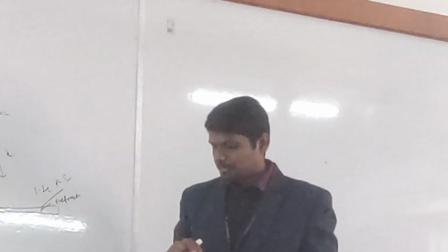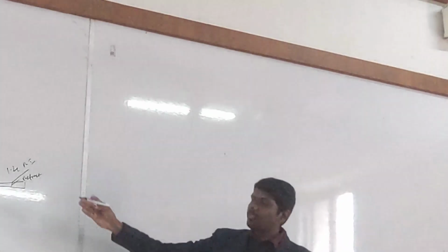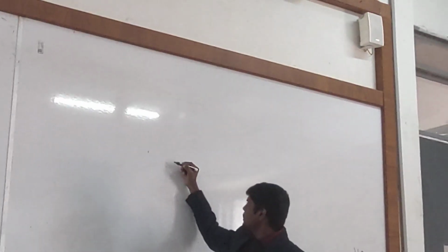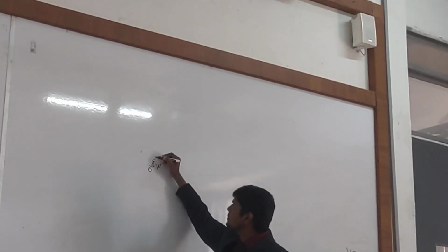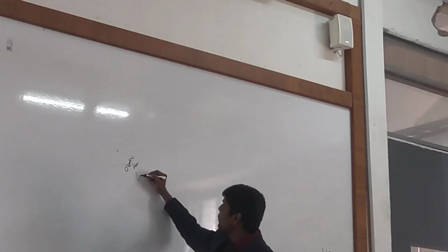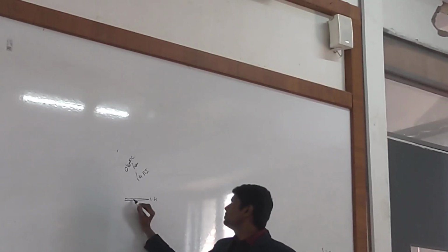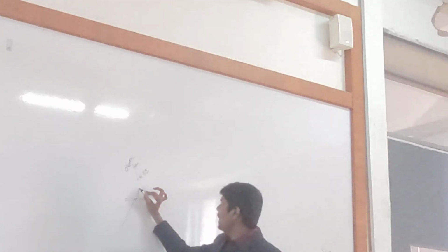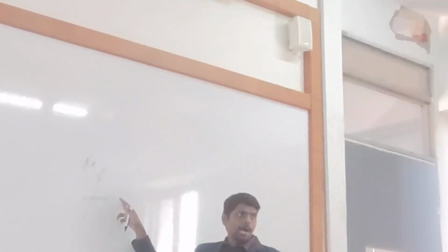Okay? Now listen. This refraction of light plays a vital role. I will tell you how. Your microscope objective lens was fixed at 1.4 RI because it can only detect 1.4 RI of my slide glass. That means light came here, it's slightly bent, and only the bent light it can detect. These two values have been standardized.